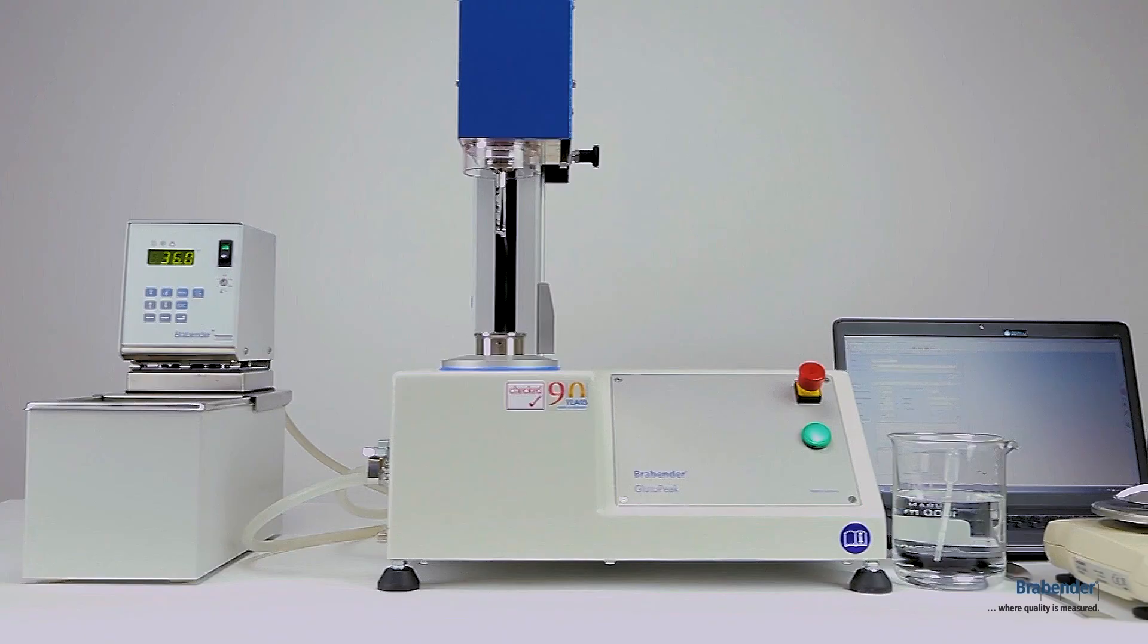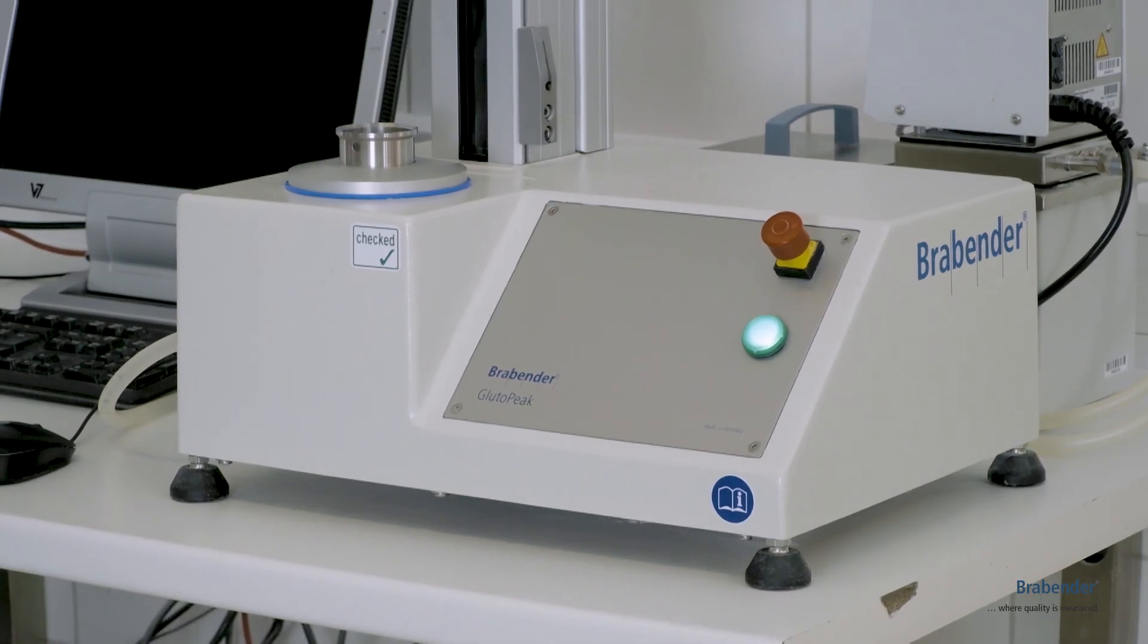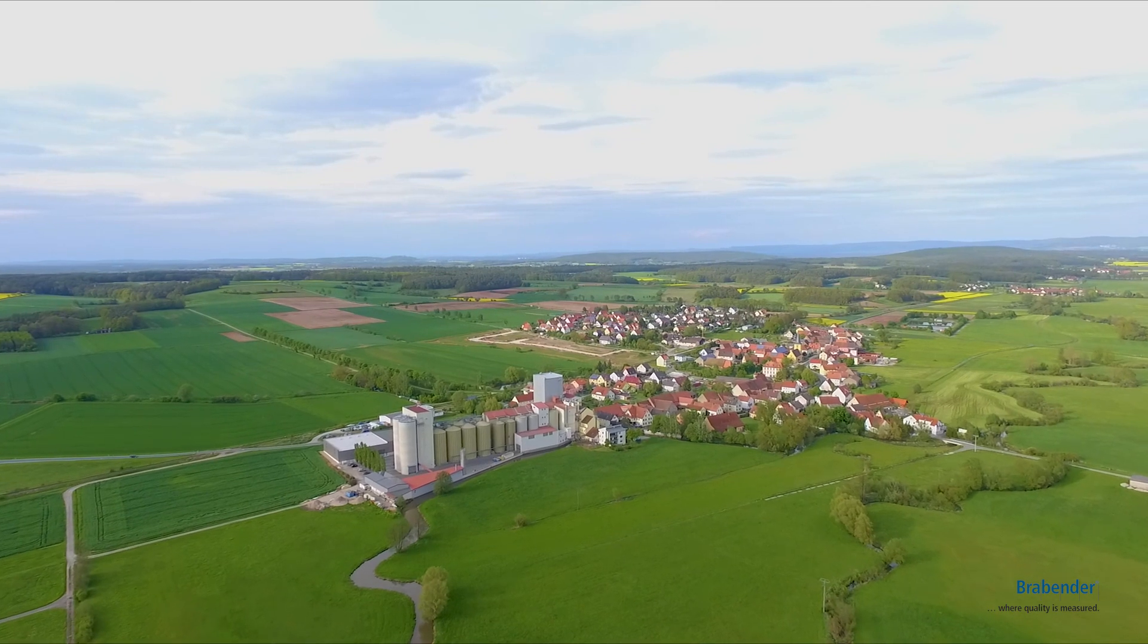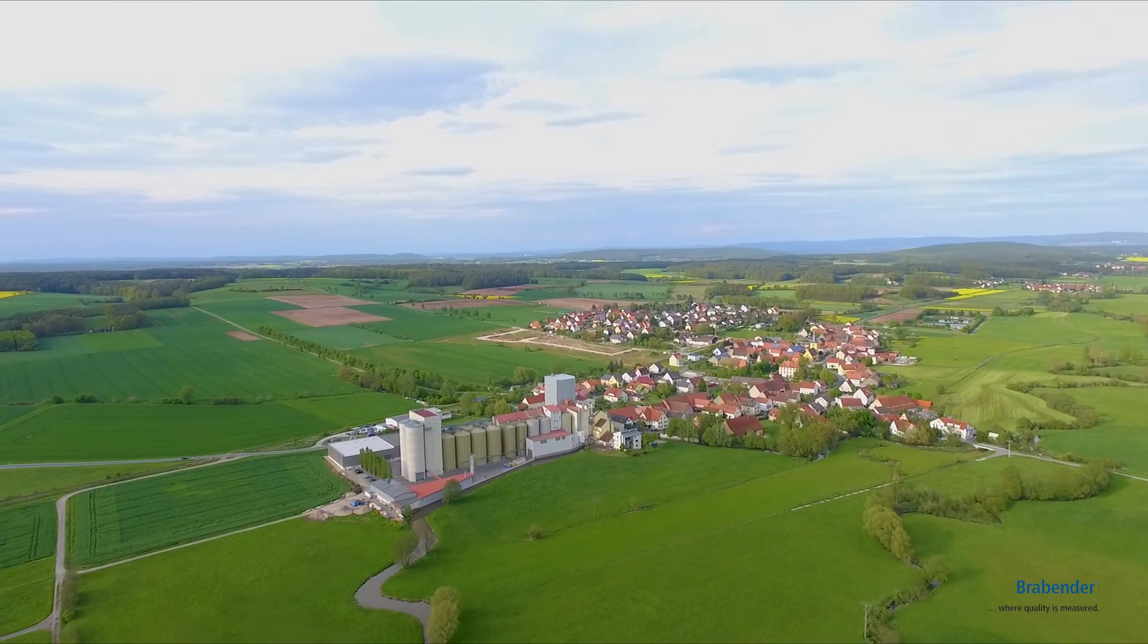The Wiesnet Mill's claim is affirmed by using the Gluto Peak in the laboratory. The Bavarian enterprise thus combines tradition with the latest in analysis technology.